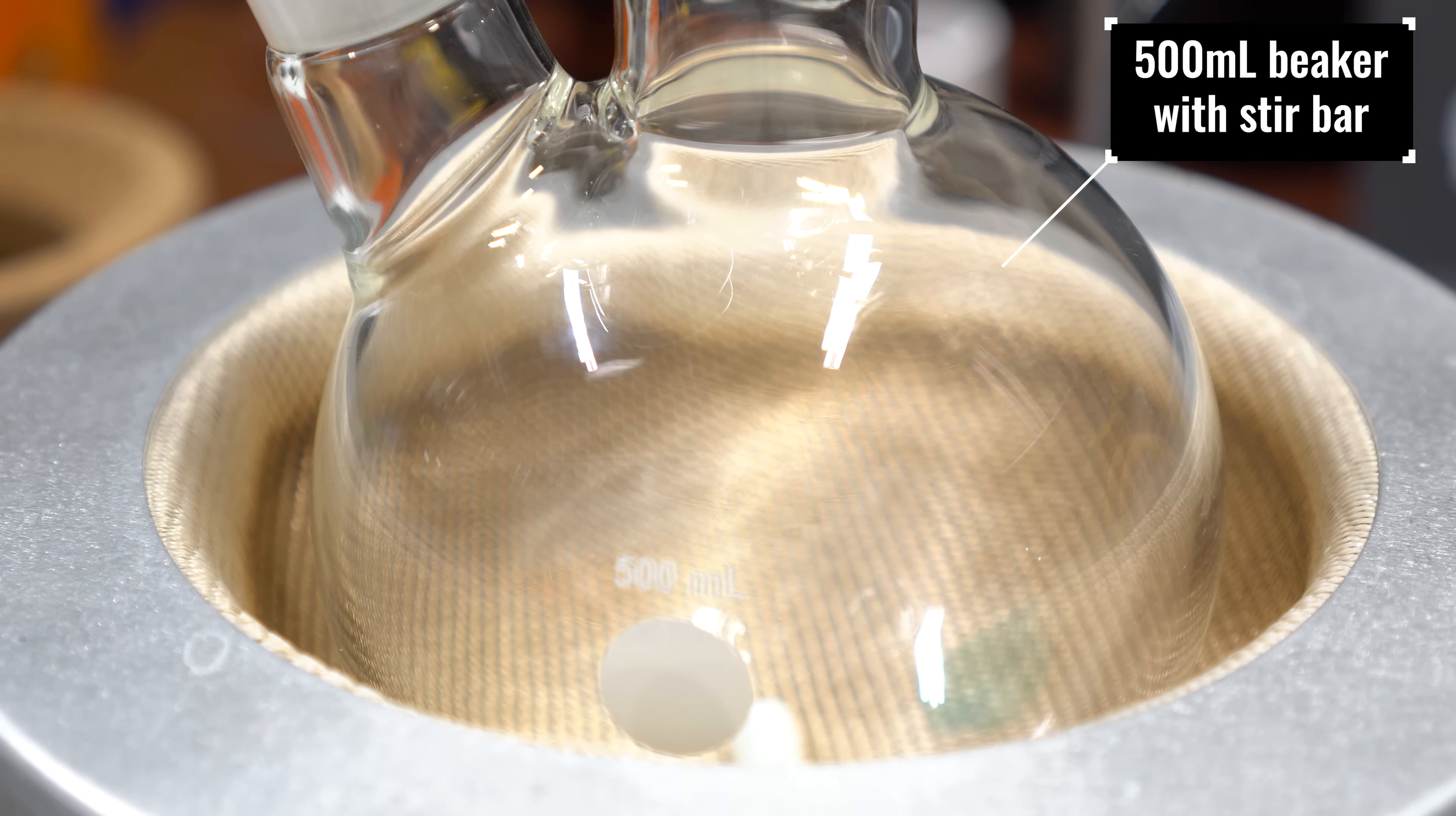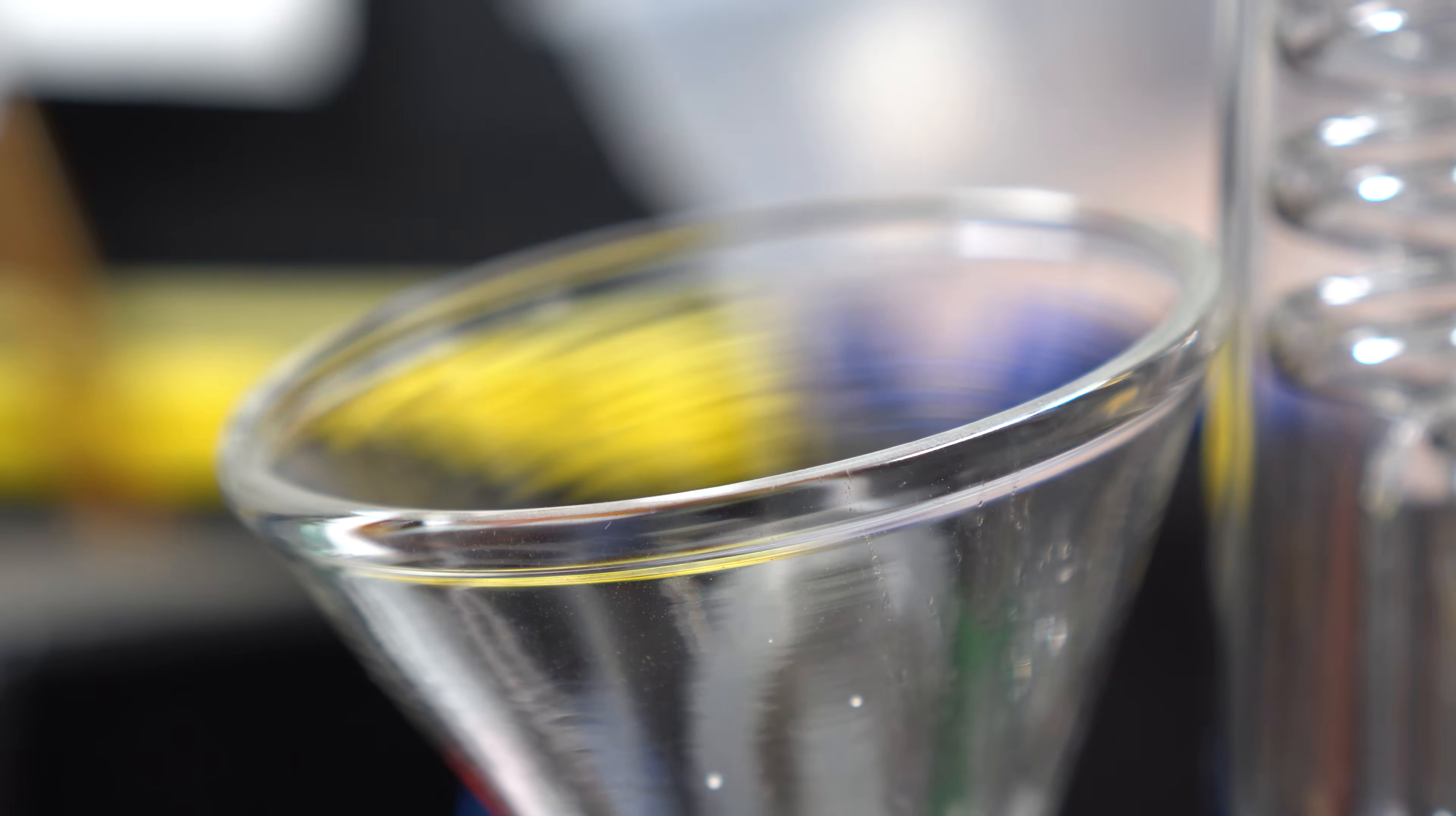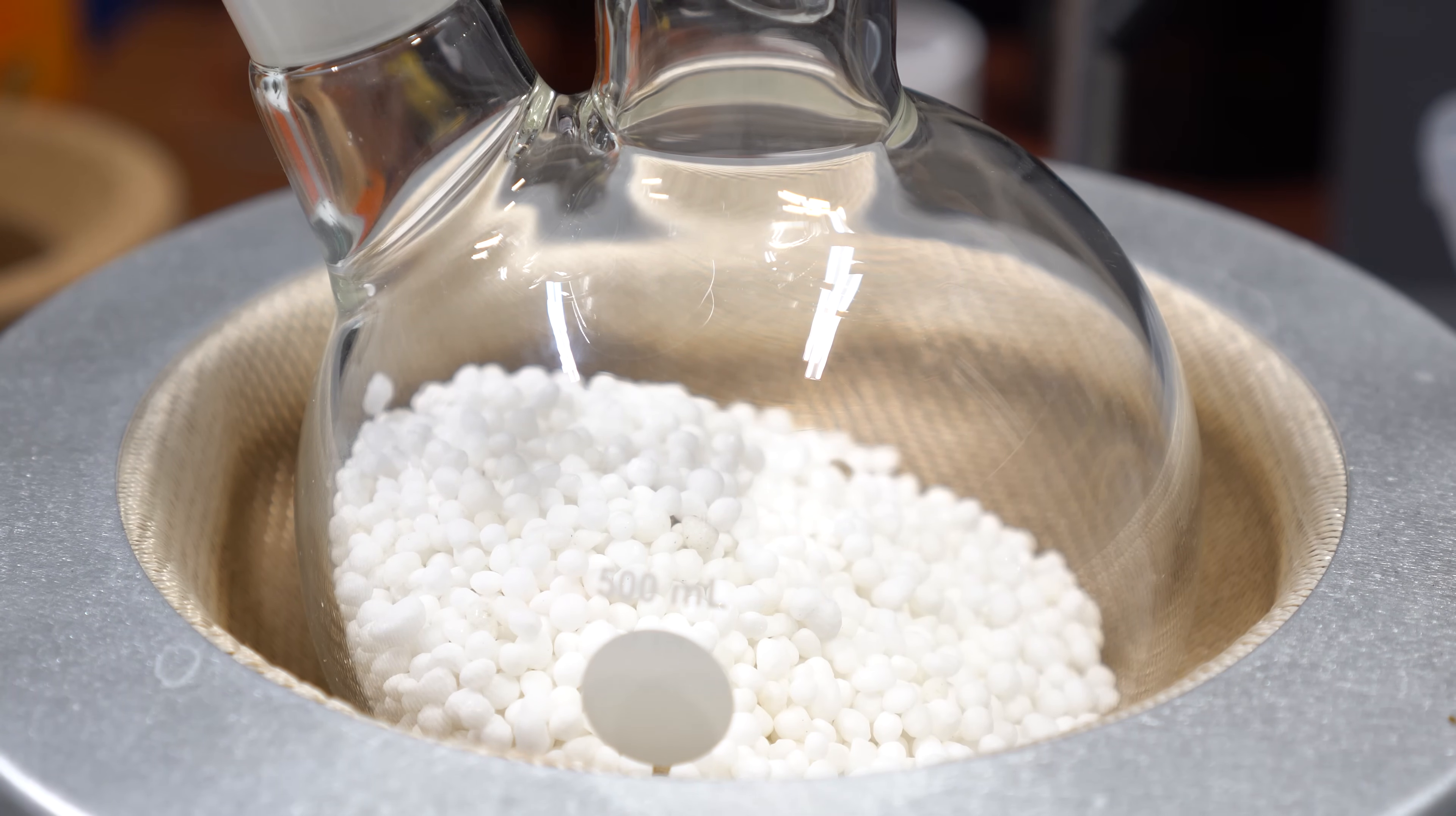To start, we're going to need a 500ml beaker with a stir bar inside. We need an ammonia source, so I'm going to be reacting urea and sodium hydroxide together. I added 120g of sodium hydroxide into the flask, then 90g of urea. I'm not going to add the water yet until I have my dry ice bath set up.